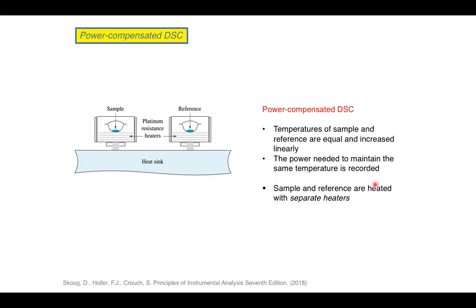And so the sample and reference are heated with separate heaters. These heaters are isolated from each other, but their relative amount of energy required, or electricity required, to heat them up is, of course, measured.